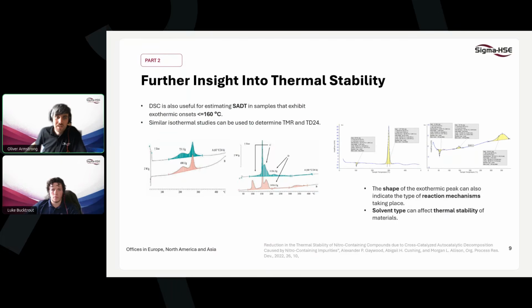So really it is a key factor to consider, as we were talking about, when thinking and using DSC at early stage process design: not just how we're going to produce this target material at our production site, but how we're going to ship it to our clients who are paying for the goods at the end. So the transport considerations really are a key factor to consider when scaling up production of a new product for this reason.